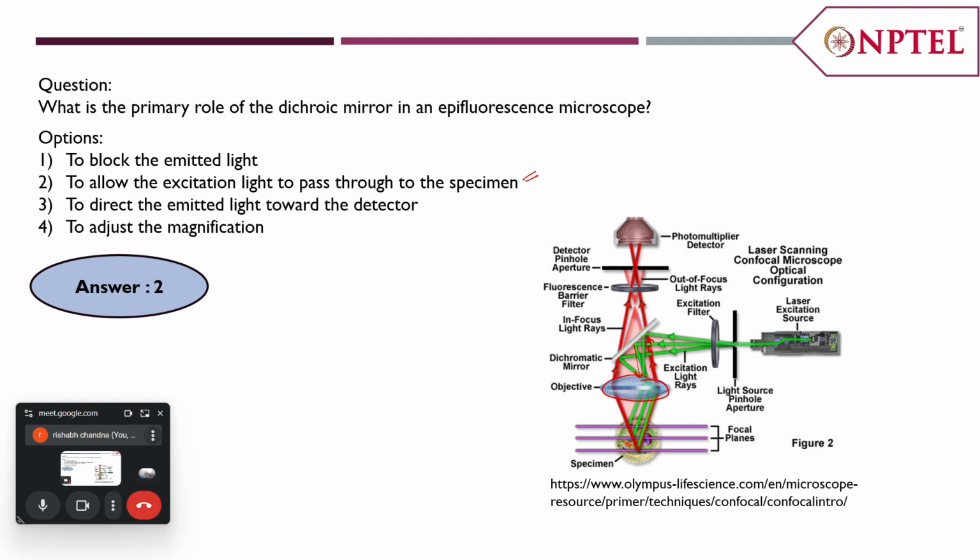In that case, the path is almost similar. For example, here in the image, as you can see, the green light is directly falling on the specimen, and similarly, the path of the light is also taken by the emitted light. Similar path is taken. So both the paths basically converge or coincide with themselves. That is why it is called an epifluorescence microscope.